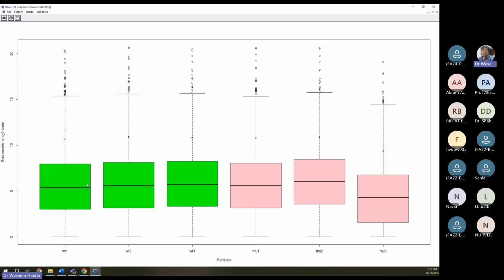Okay, so of these 3, the wild type ones, the control group, seem like expression is good, not normal, but close to each other. So these 3 distributions are close. Here, the treatment group gets lower medians; we compare medians normally in those box plots. This one is slightly higher, and this goes down. That always happens in an experimental group. When you're applying some treatment, that treatment is good, his hand was good, here again good, here maybe he was harsh, or that plant has a bad day, or that animal had a bad day. So overall expression was low in mu3, right?